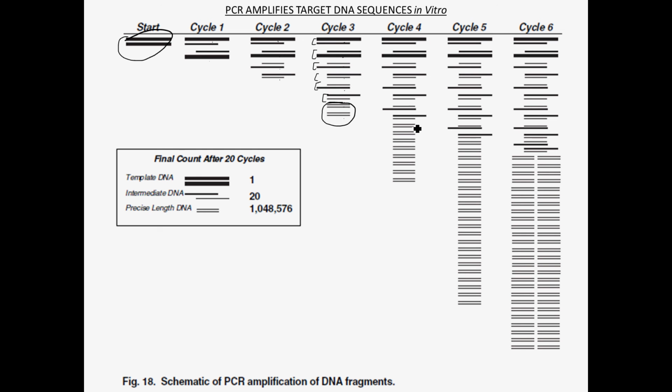So after 4 cycles, you see it now, we're starting to get lots and lots of copies, way more copies here of just the target sequence that we're looking for, and the ratio of the target sequence we're looking for to all these other fragments that have these overhang areas here, right, is becoming greater and greater after cycle 5.